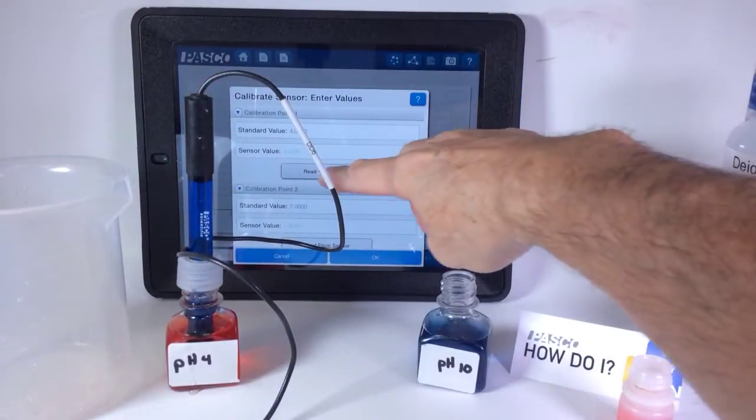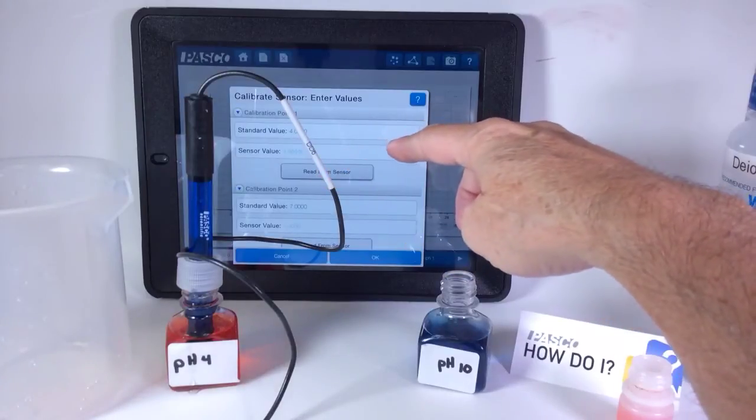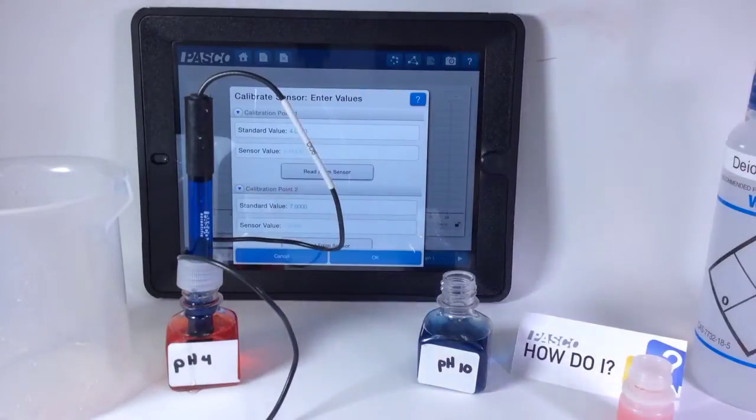Let it set for a moment, and then hit read from sensor. It now knows that one is a pH 4.